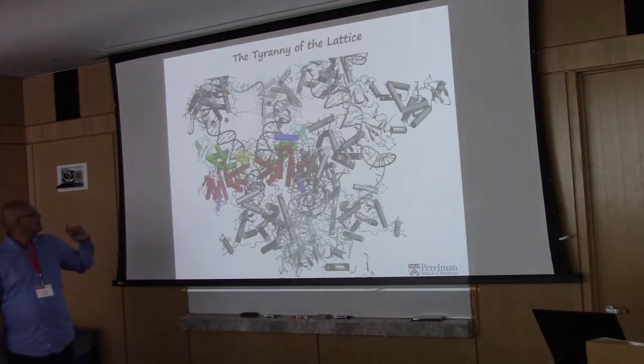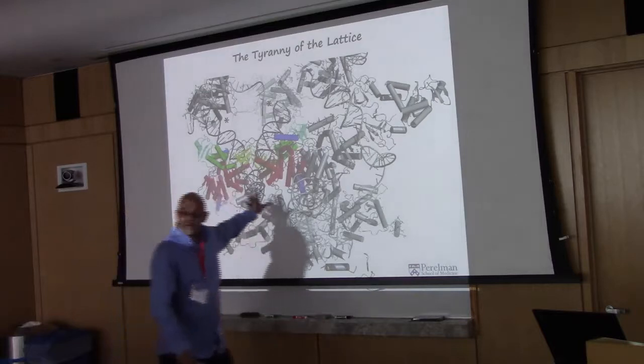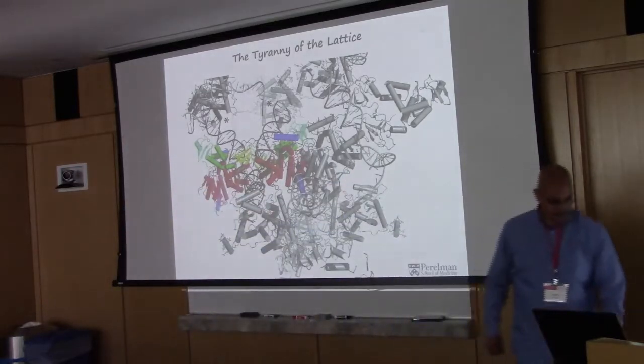So this is where solution scattering is very useful, to see if this dimer in the asymmetric unit bound to DNA really is related to this tetramer that's apparent in the crystal lattice packing. Okay, so that was one of the questions we had. This is what the reality is of that fish in the sardine can.